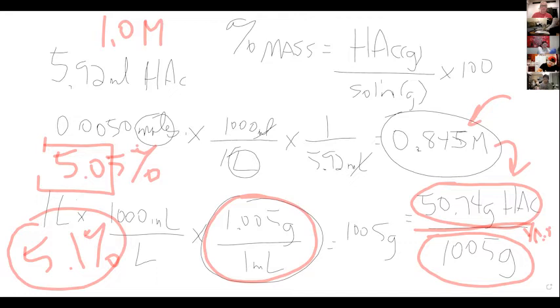All right, so should we review? That was just for one determination, so you're going to do 3 and get an average. That's for this sample. And then you're going to use your own. And then finally, the third table, let's have a look at that.